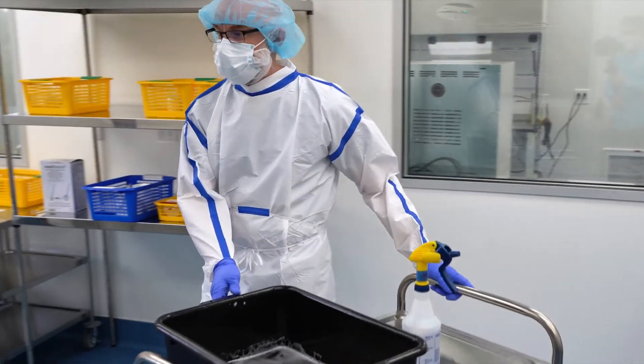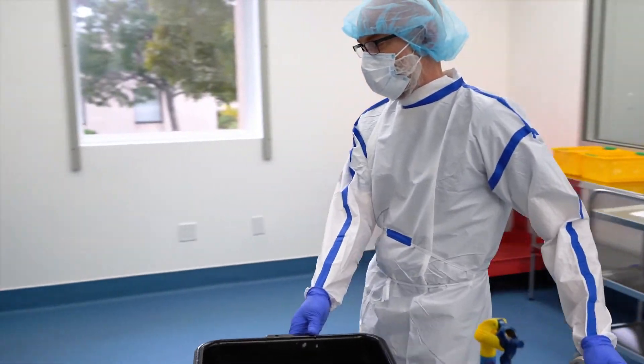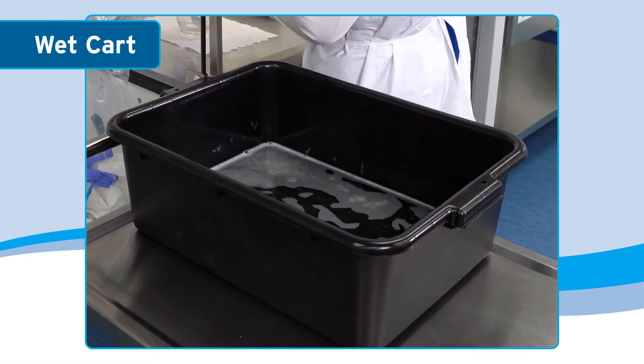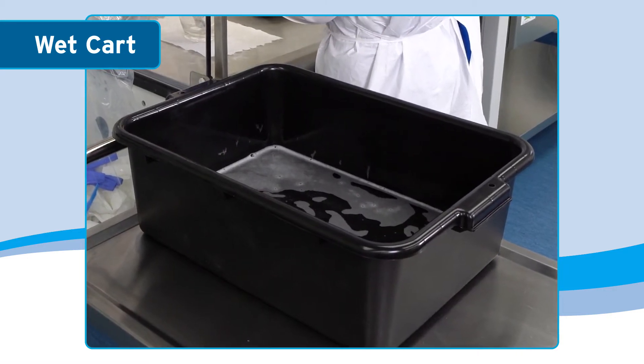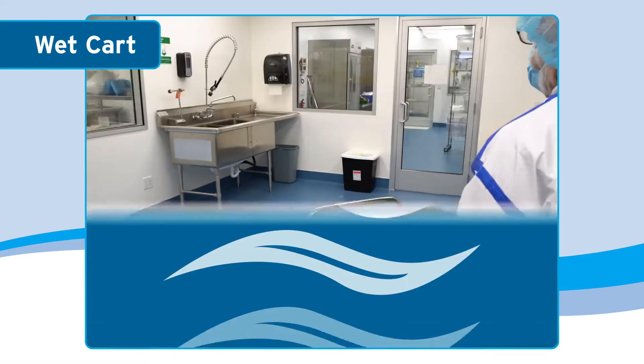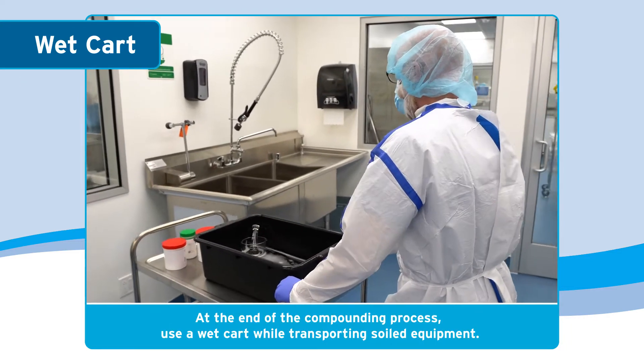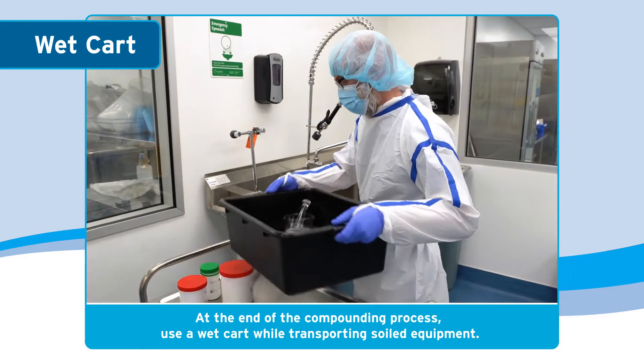As part of the pre-staging workflow method, it is best practice to have a wet bin located just outside the face opening of the CVE. This will come in handy at the end of the compounding process while transporting soiled equipment to the sink for cleaning, which will minimize potential environmental exposure of aerosolized powders.